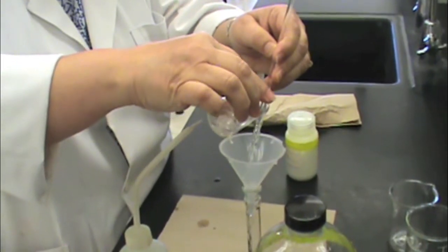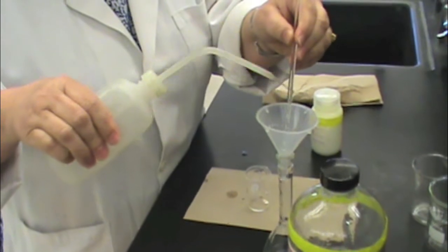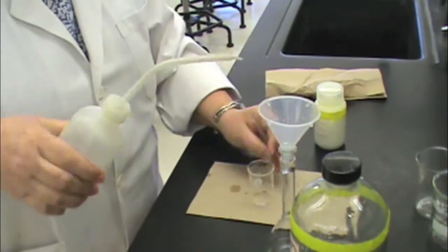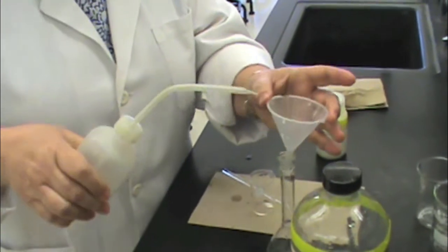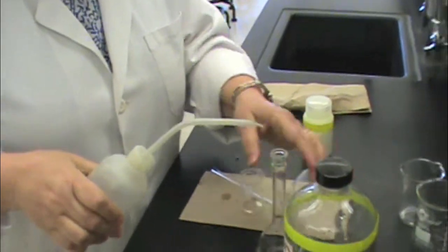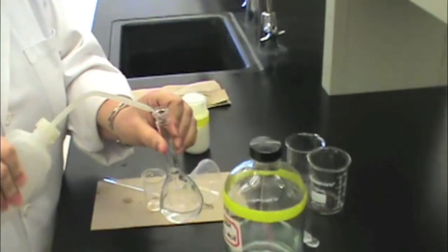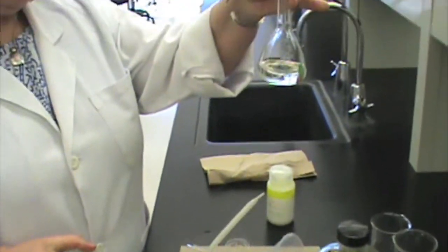Make sure that when you pour, you pour along the glass stir rod to transfer well. Then rinse your glass stir rod and your funnel to make sure that all of the solution is now in the volumetric flask. Then wash the sides of the volumetric flask so that all of the solution is at the bottom.